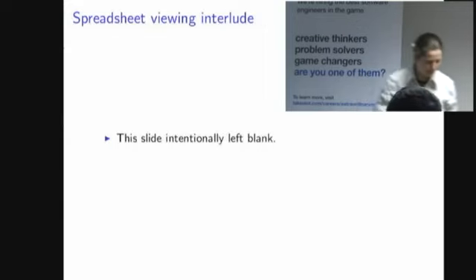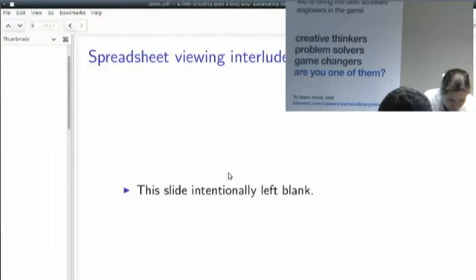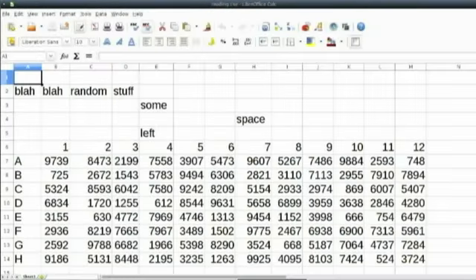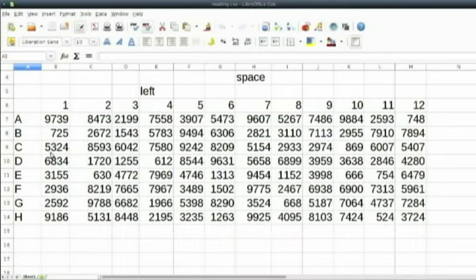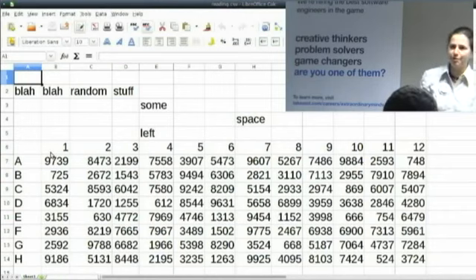And I will, at this point, show you what the files look like, because at the moment this is a bit abstract. So the readings look something like this. The real data has like a header on top which tells you things about the plate reader, but essentially it's a grid of numbers, 8 rows by 12 columns.